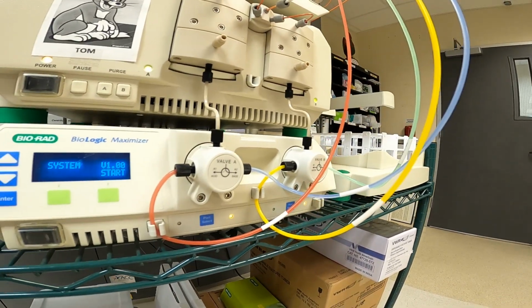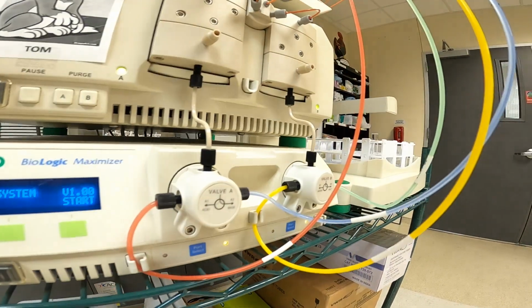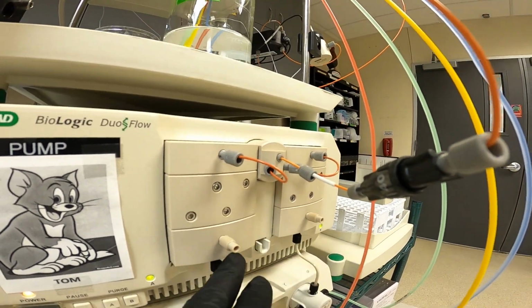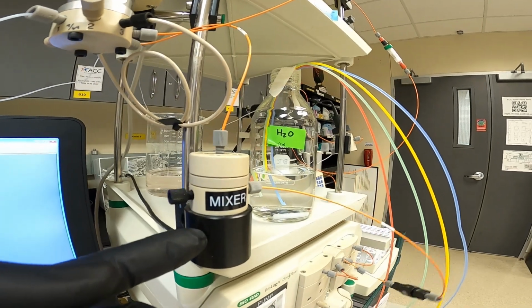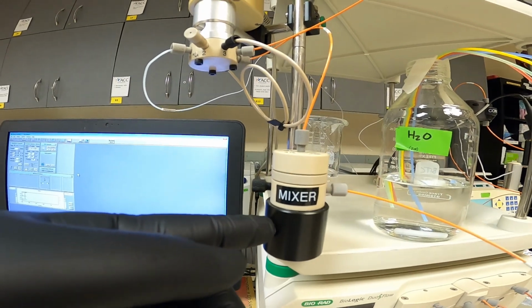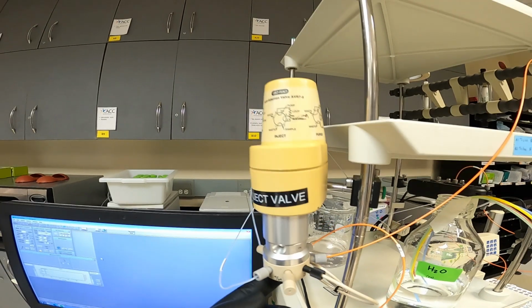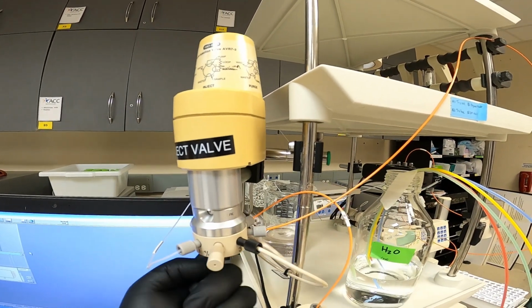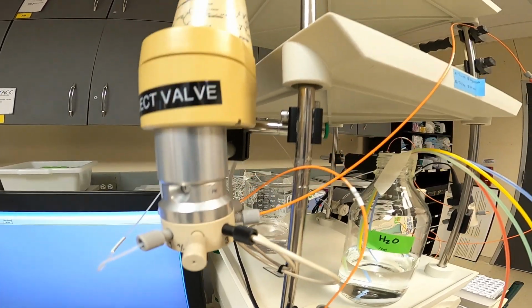The mobile phase will be drawn in through the inlets into the maximizer. It has 4 ports, A1, A2, B1, B2, and they travel up through each of the pumps. Next, we enter into the mixer, where the system has a little stir bar that will make sure it's homogeneous. And then here's our inject valve. Again, this is a 7 port valve, ports 3, 4, 5, 6, 7, with 7 in the back. 7 ports and then 3 positions.